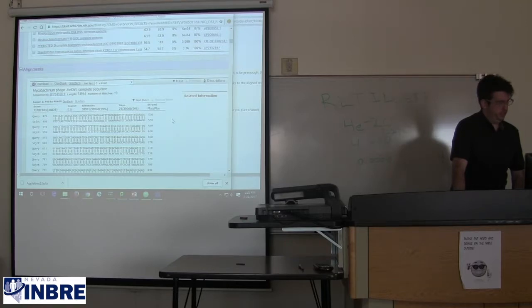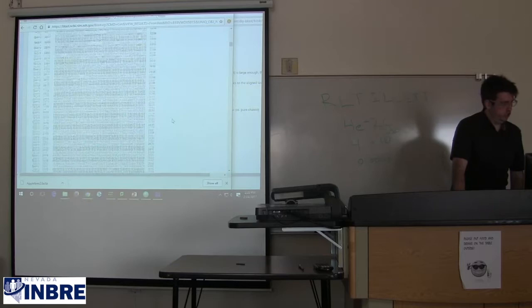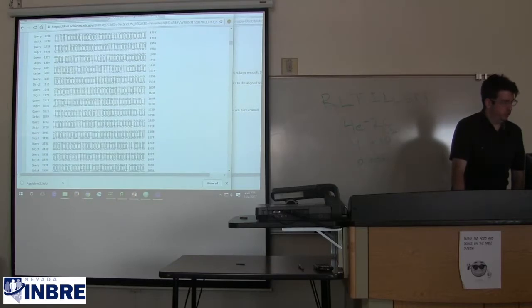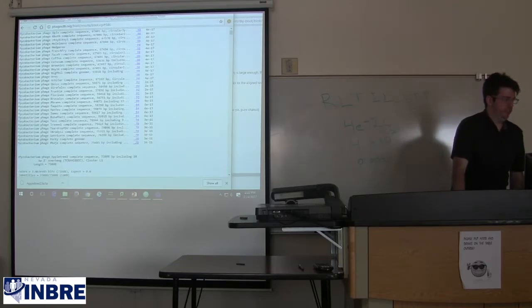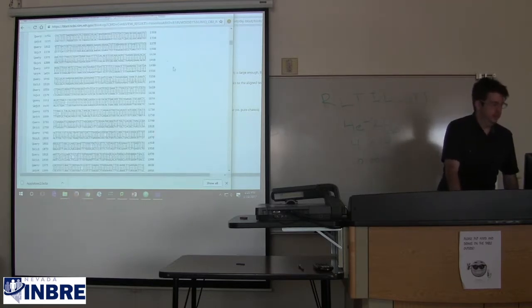In general, NCBI has just a slightly prettier, more updated version of these kinds of results. What you see at PhagesDB is actually what NCBI's results looked like back in like 2007. They're slightly prettier now, a decade later.